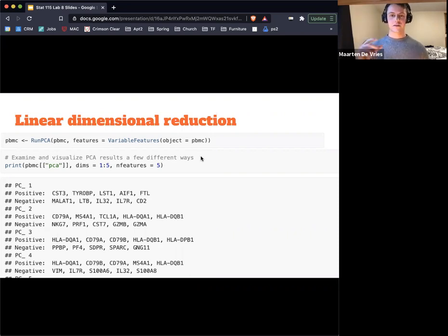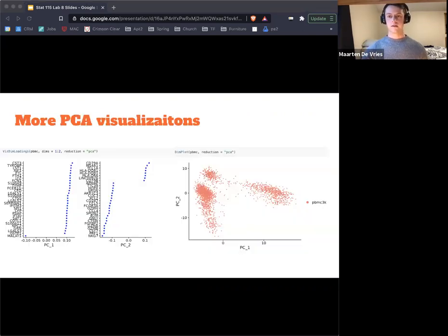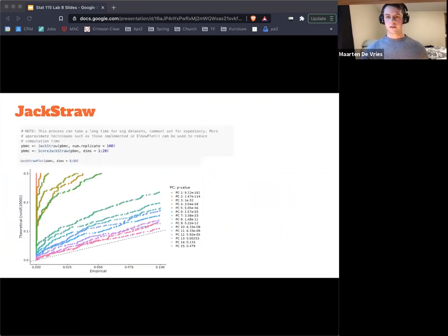So if the coefficient value is very high, this gene has a lot of effect. On the left plot here, you're essentially plotting that, but we just printed it. And on the right, we have a, as of yet, uninformative dimensionality reduced plot. But let's move on.